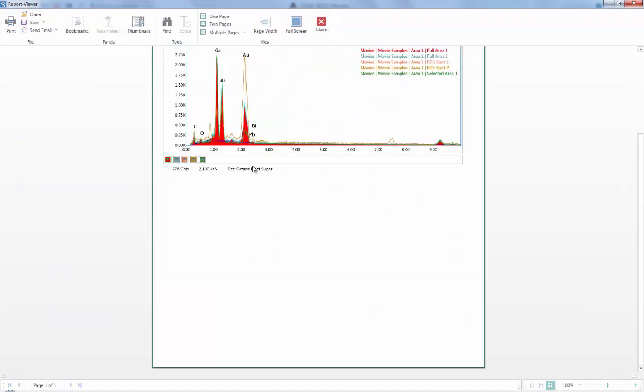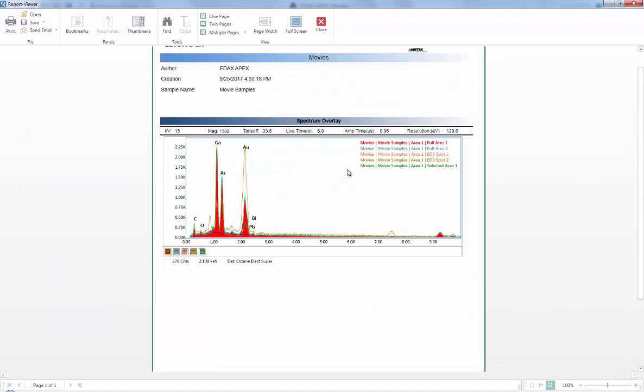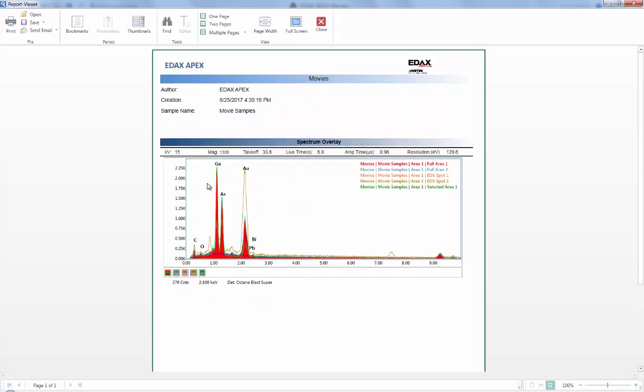So here in this case I can see I have all five spectrum, same collection times, and information up here on top of each other, and we're done.